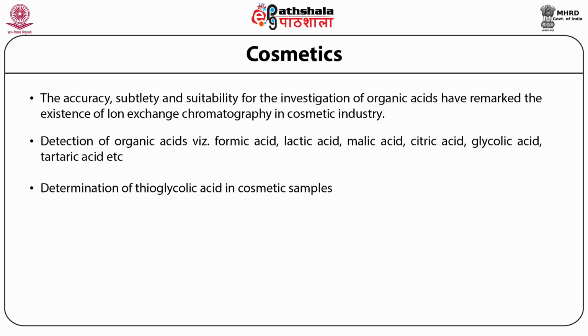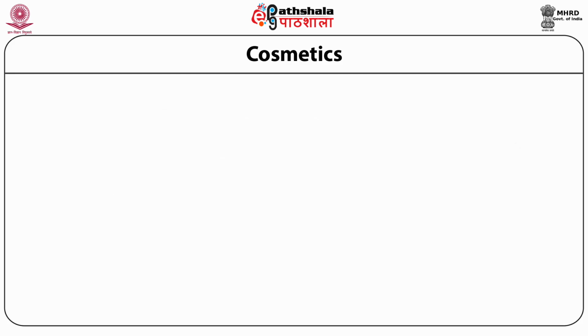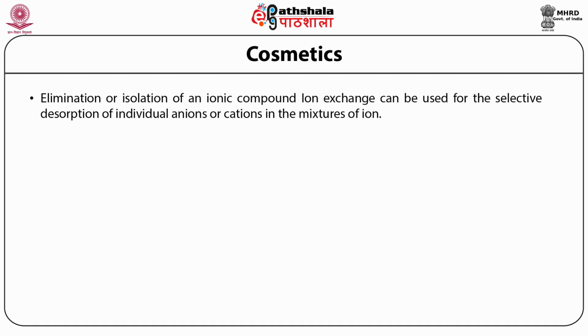conductivity detection. Ion exchange chromatography is beneficial whenever the analytical problem consists of elimination or isolation of an ionic compound. Ion exchange can be used for the selective desorption of individual anions or cations in mixtures of ions.